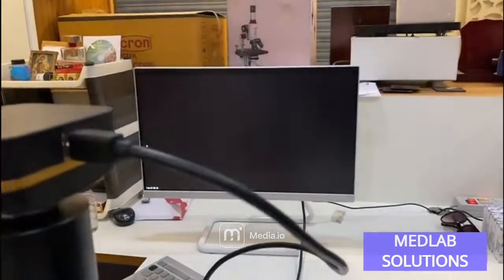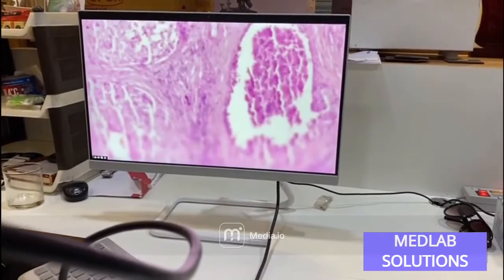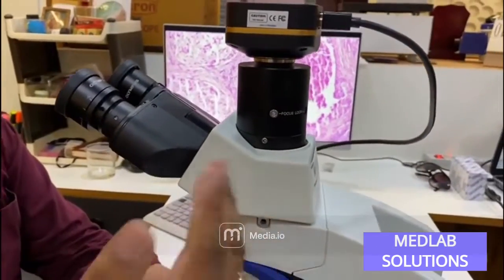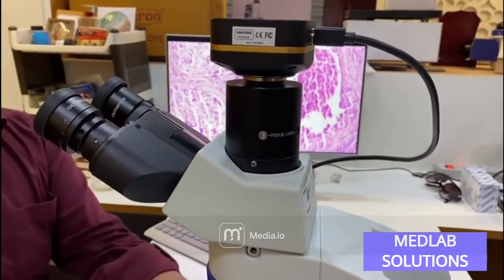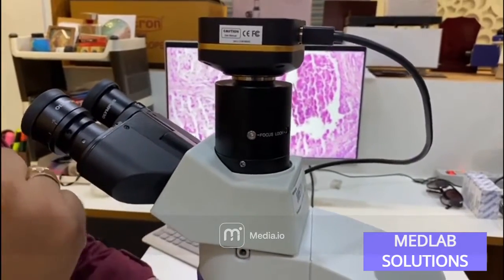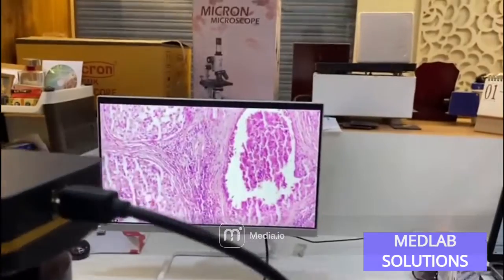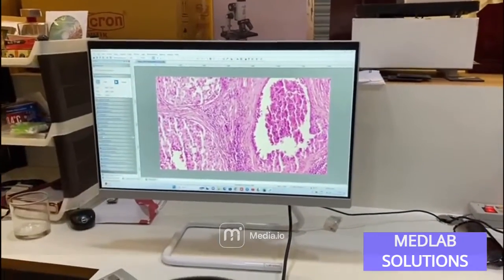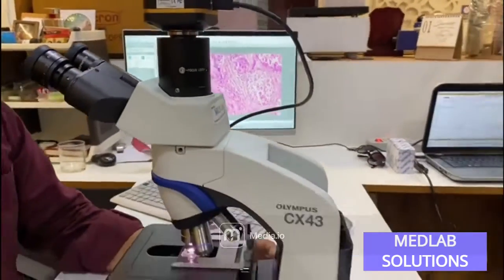A key advantage of this larger Olympus microscope is that there is no separate knob or turret to switch between eyepiece and camera viewing — unlike earlier Olympus models. Here you can simultaneously see through the eyepiece and observe the live image on the camera screen. The remaining features depend on whichever camera you have chosen. This was all about the CX43 Olympus model.